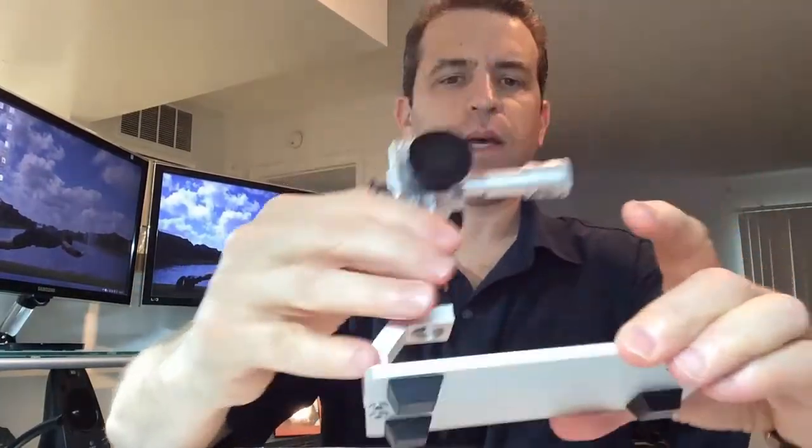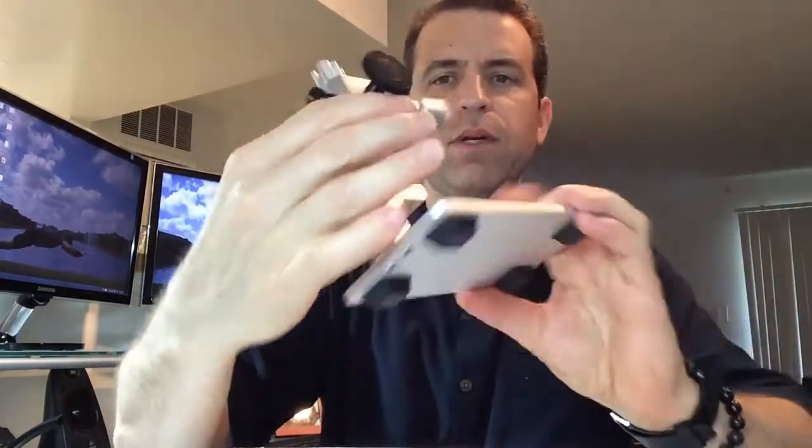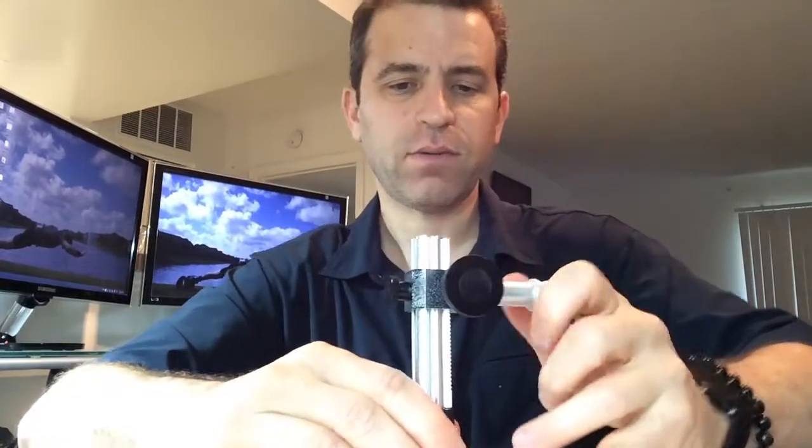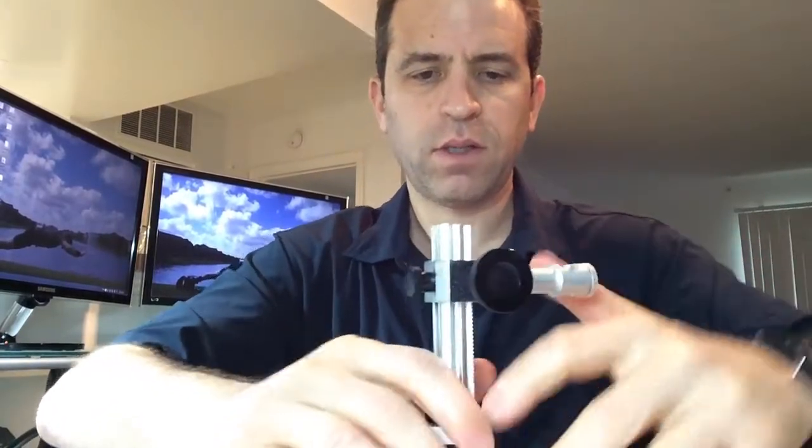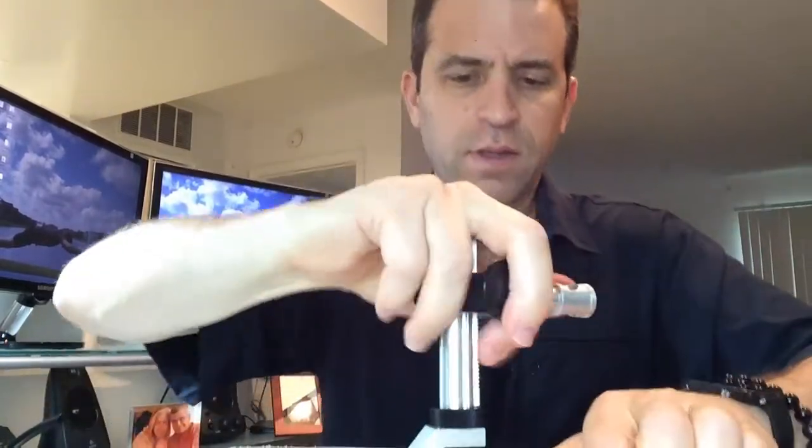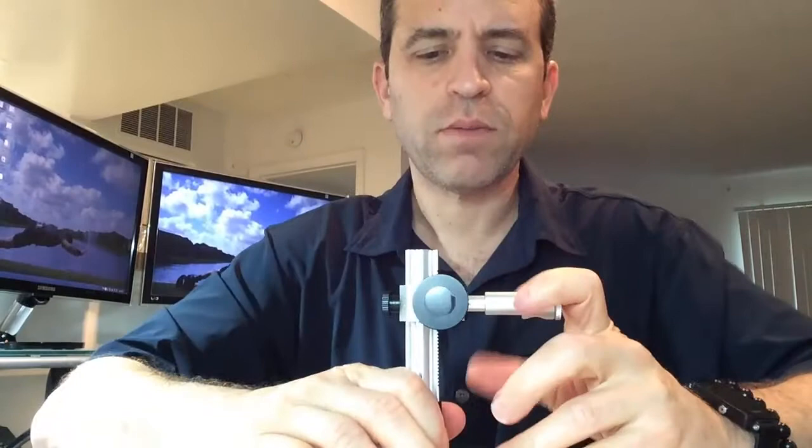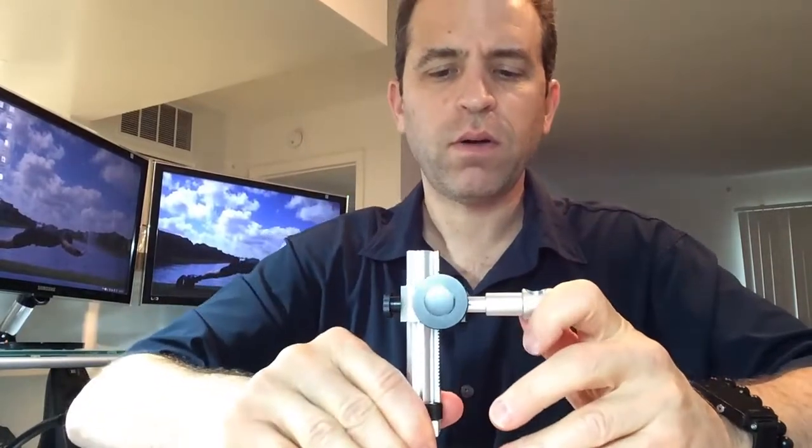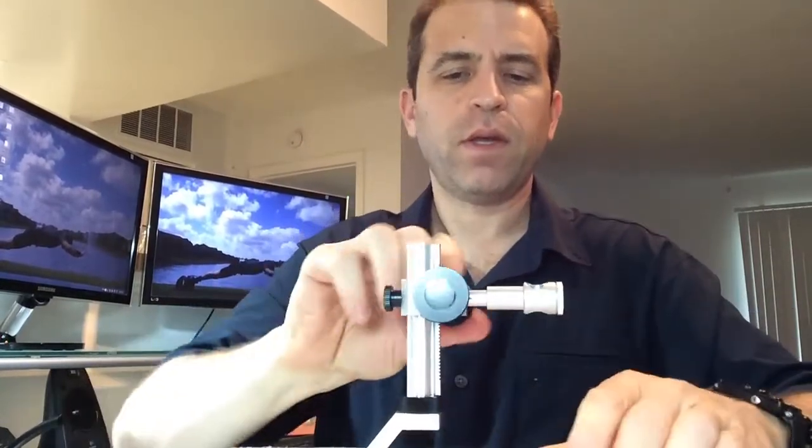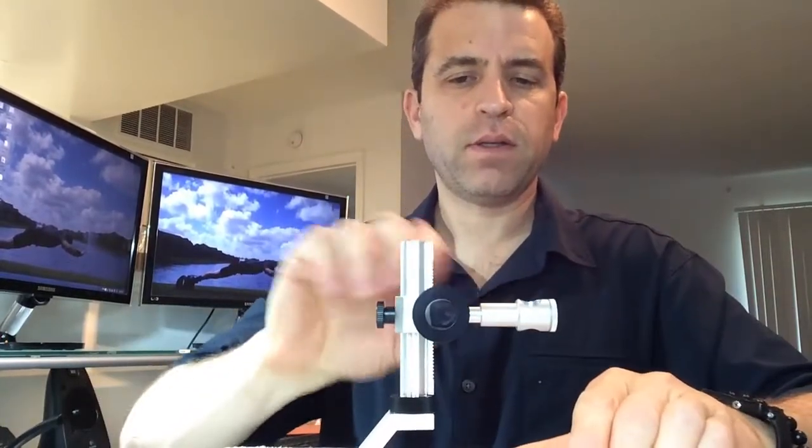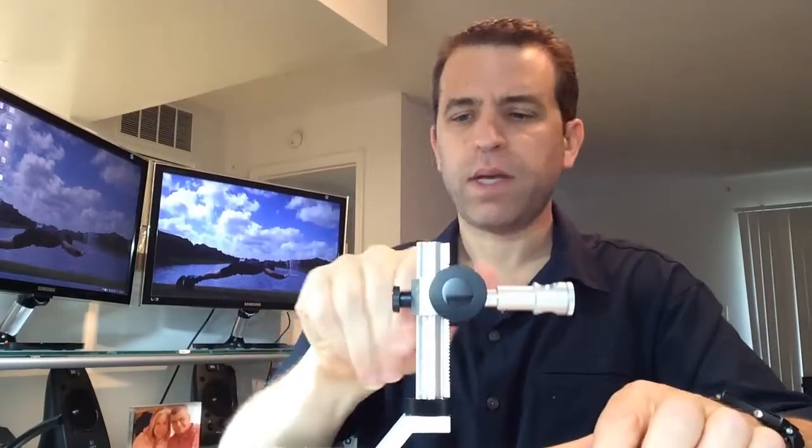Very good. You've got this knob here that you can turn this plastic piece so then it locks it in place. Look at that, that's pretty cool. I'm feeling like a scientist right about now. Then you've got this knob, very smooth mechanism, the up and down.